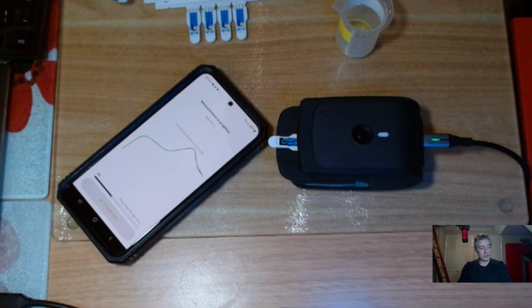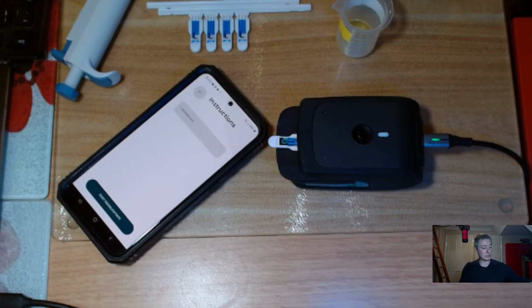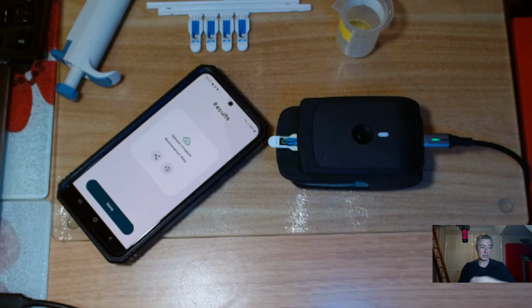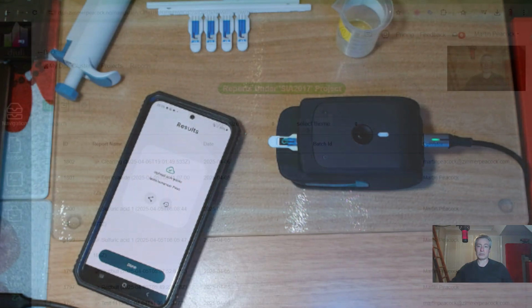And the one thing that's valuable in either teaching or in research or in characterization is just not wasting time. So this is a very efficient way of doing it. And also the biggest thing that goes on in industry is people then analyzing data, but you're going to see that all that data just gets analyzed for me. So it says upload complete. Okay, that's done. Share the screen with you here.